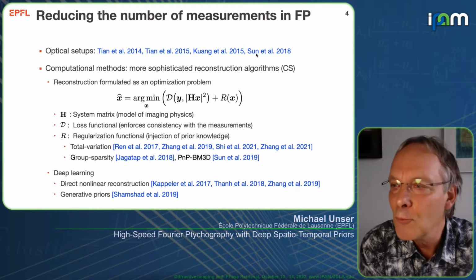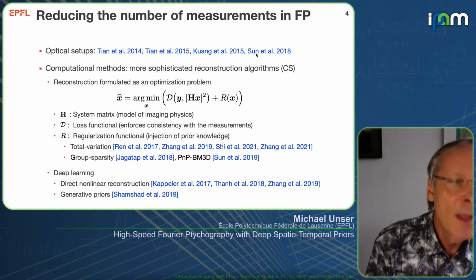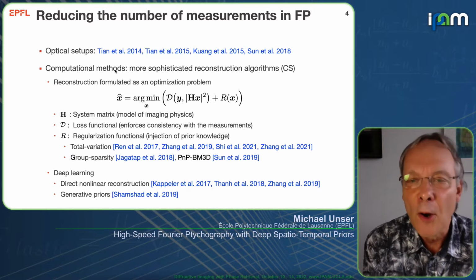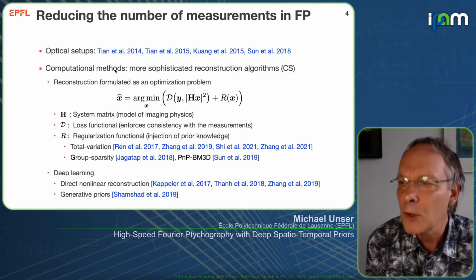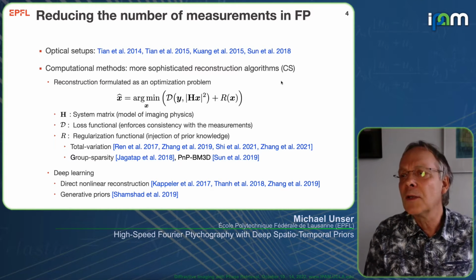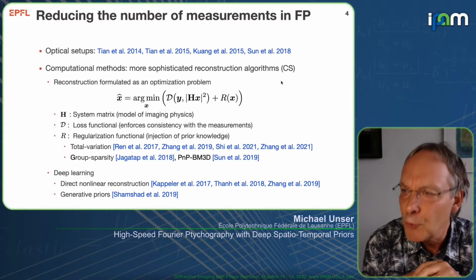But my team, we are not optics people, we're really computational imaging people. So we are more on the side of trying to get improvement by working on the reconstruction algorithm. And you could say this is really an instance of compressed sensing.